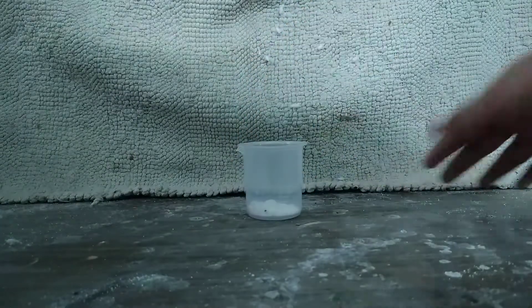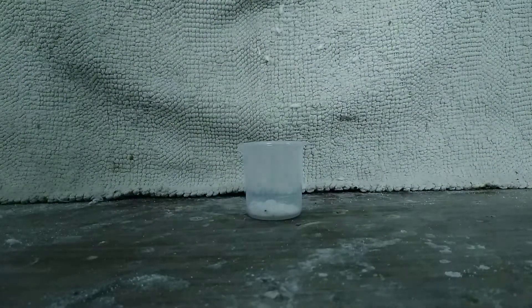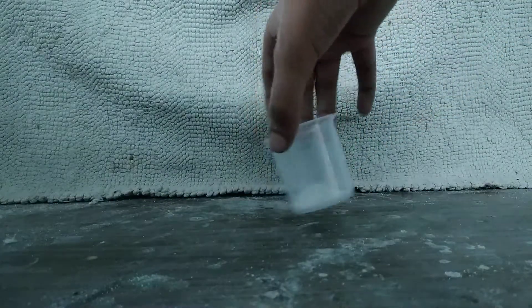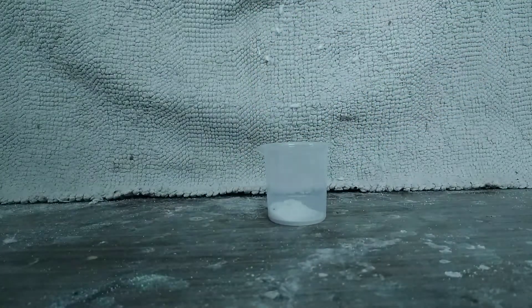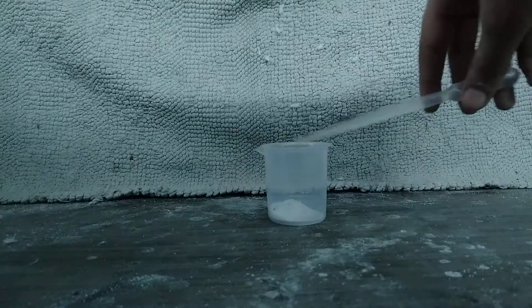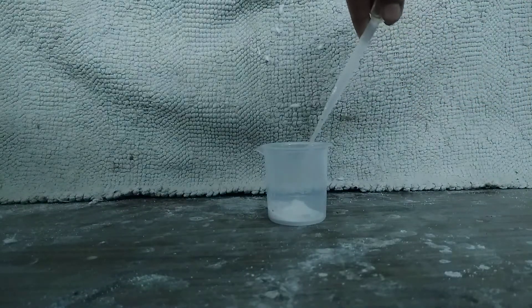My whole desk is now covered with this powder but I will clean it up later. Right here I have my sodium polyacrylate in this beaker. Now let's test its cool property of absorbing a lot of water. It can absorb around up to 30 times the size of itself.